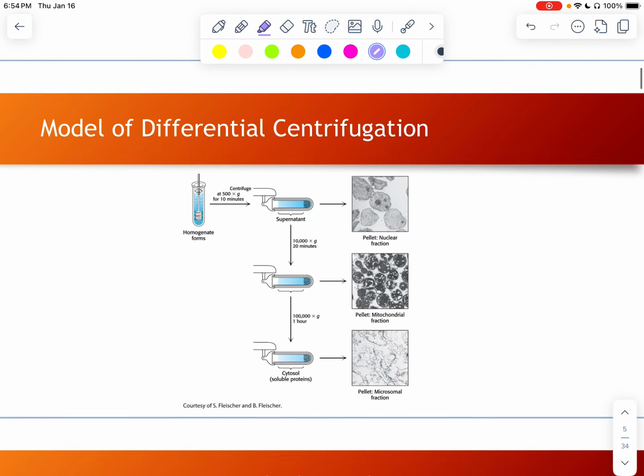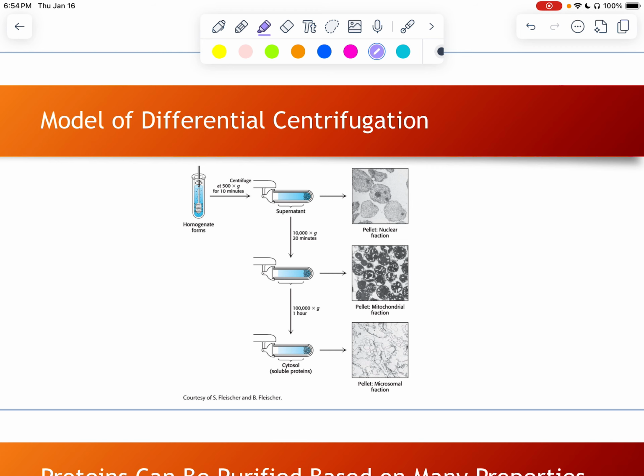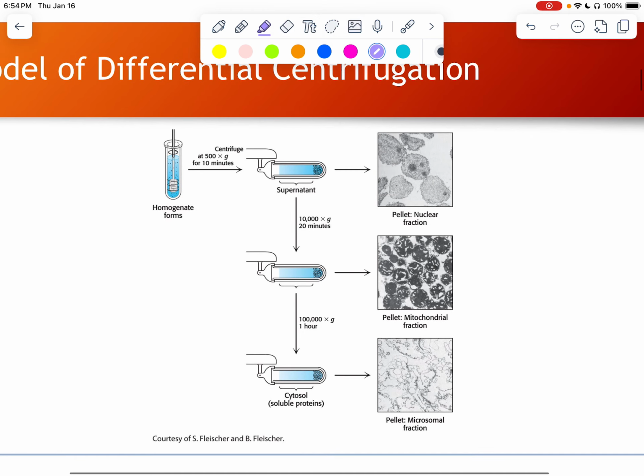And so if we take a look at what this might look like, we have our original sample, and we have both our pellet and our supernatant. That pellet might have, for example, a bunch of nuclei. But then we're going to take just the supernatant and centrifuge it again, now at a higher speed. And now we're going to get maybe some mitochondria, some pieces like that, smaller things. Centrifuge it again, and we're going to have these soluble proteins left here, and we would get some other small pieces in that pellet. So essentially, we can start this way, separating out bigger items from smaller items.